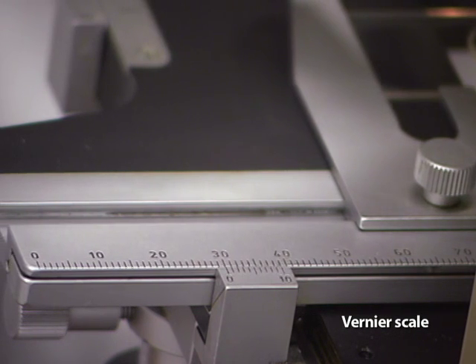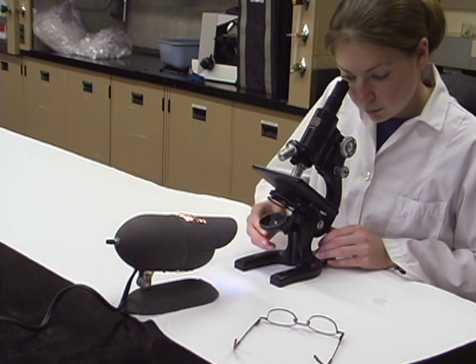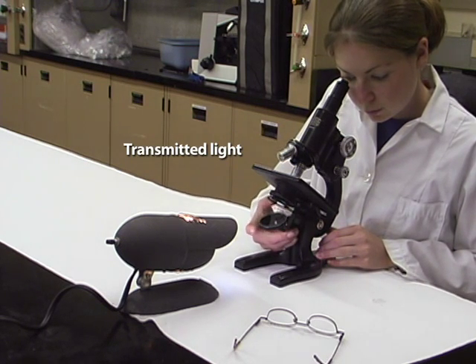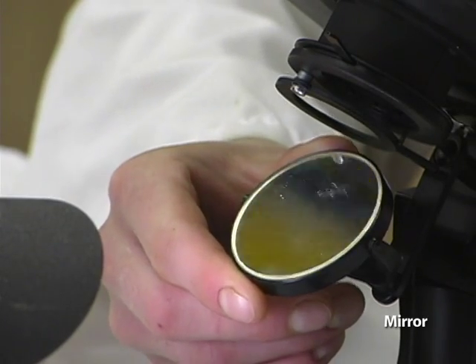A vernier scale allows references to one-tenth of a millimeter. All compound microscopes use transmitted light. Simple compound microscopes do not have a built-in light source. Light is directed to the lenses by a mirror.